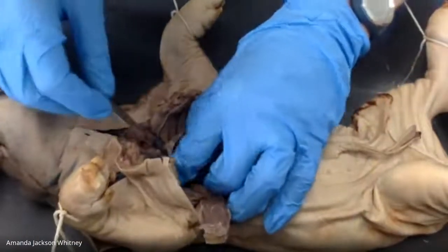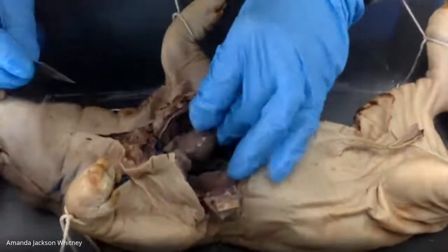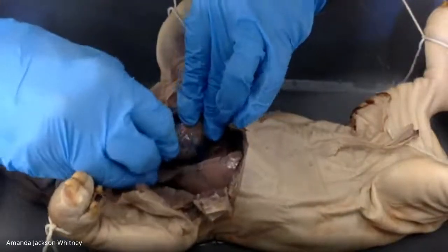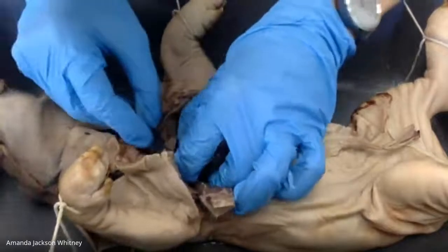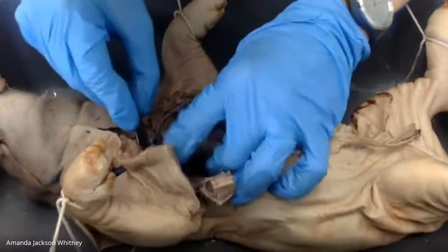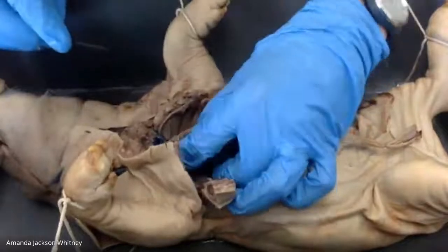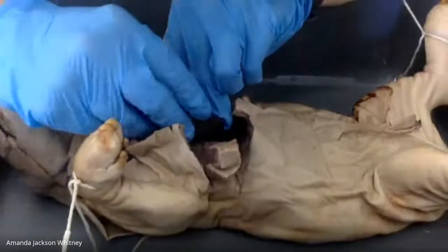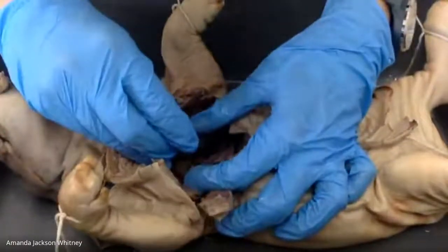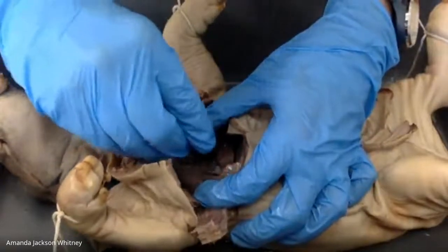I do believe, is the first one the heart dissection or is it the lung? I think it's heart, right? Dissection 4. Is that the heart? Yes, no, maybe so. Yeah, it's the heart. Okay, cool, thank you. So I'm gonna cut the heart out first. Before I do that, this one actually. Oh my god. That is so rough. Did you just cut open the stomach? Yeah.